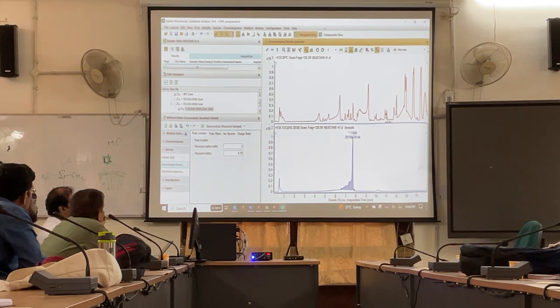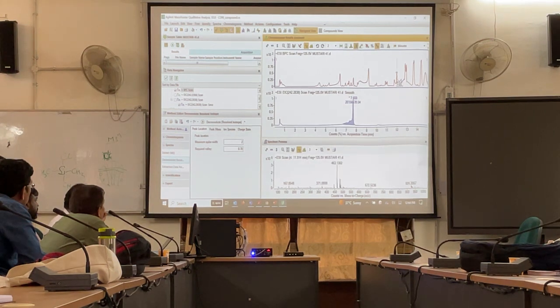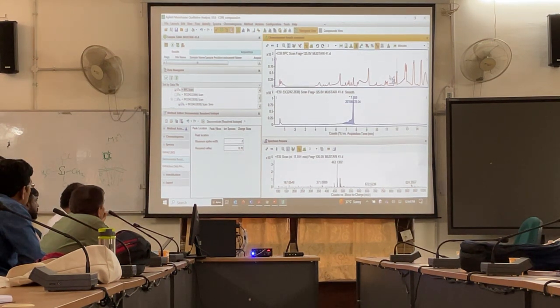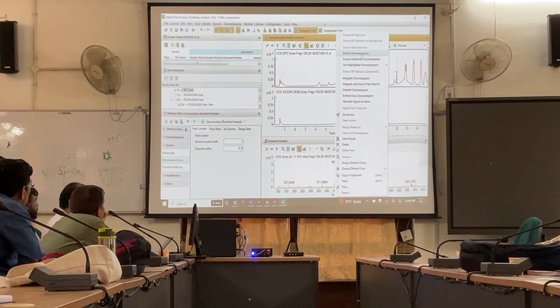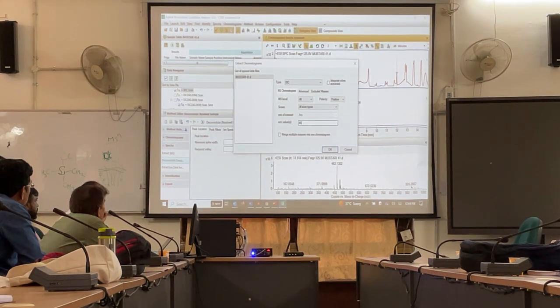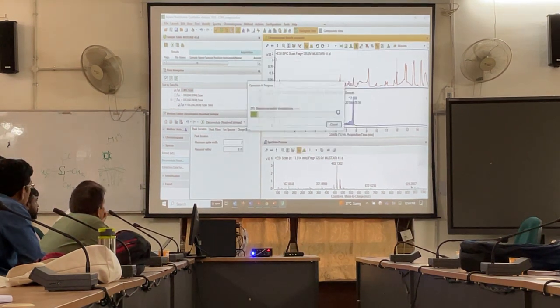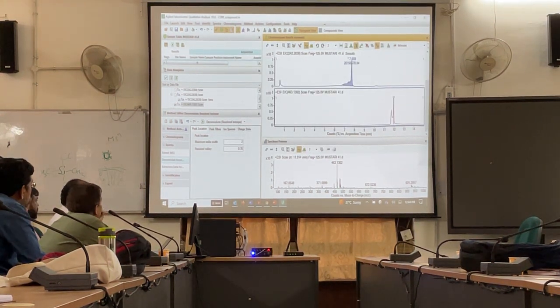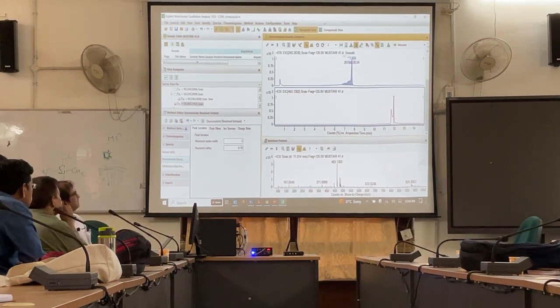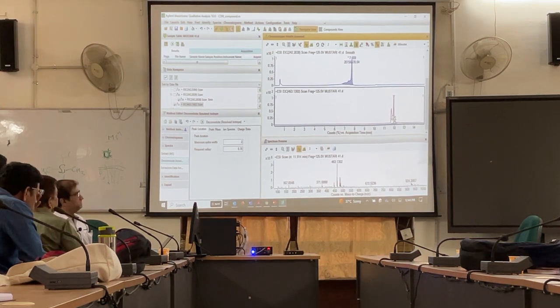So you see any other peak here, similarly. So 463.130. Now you have these two EICs. This is 242 and this is 463.